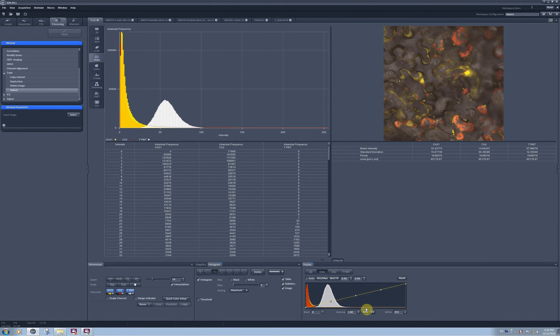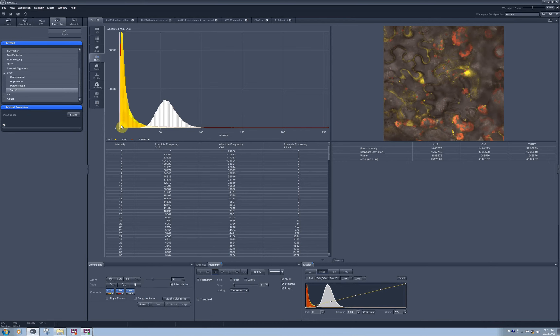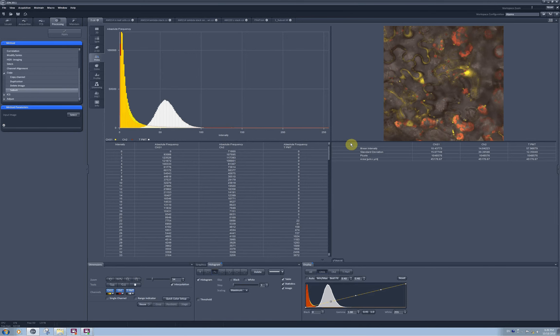This histogram is a blown up representation of this histogram. Here I have the absolute frequency of pixels with different intensities, and I see three different plots because I have three different channels on the image.